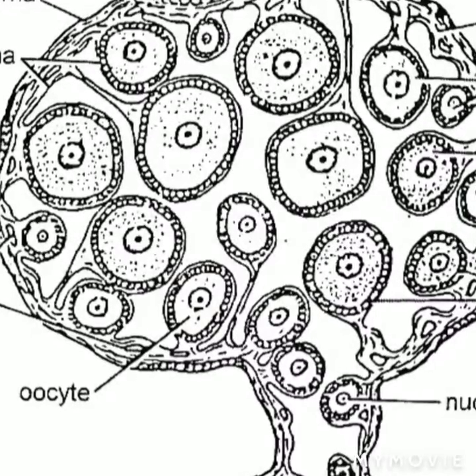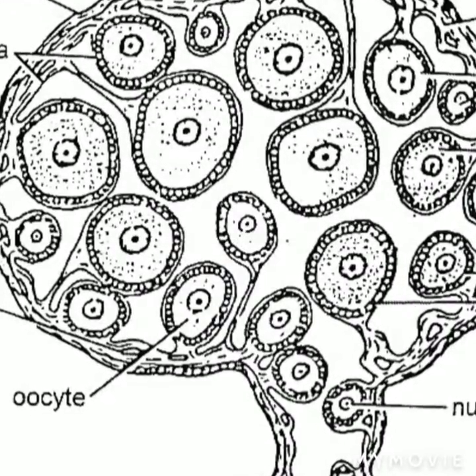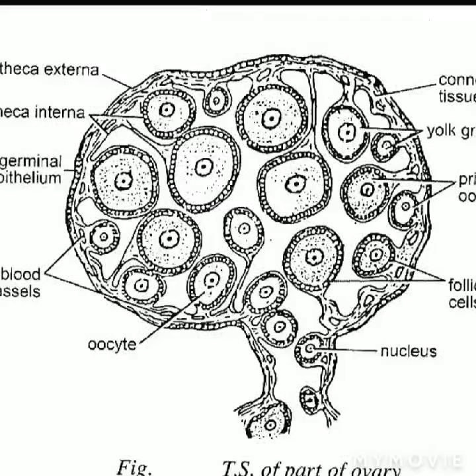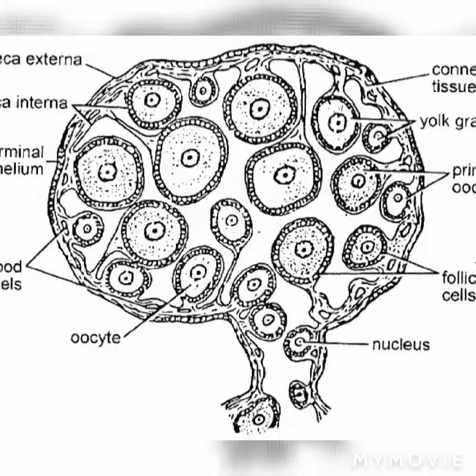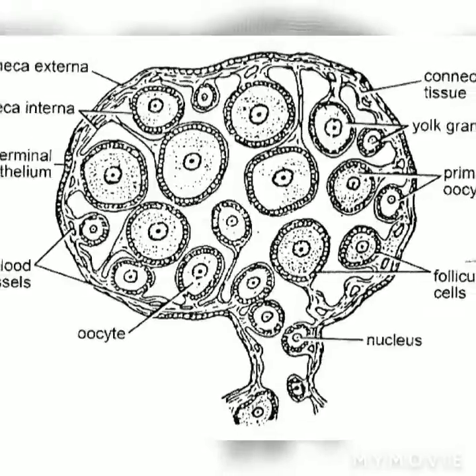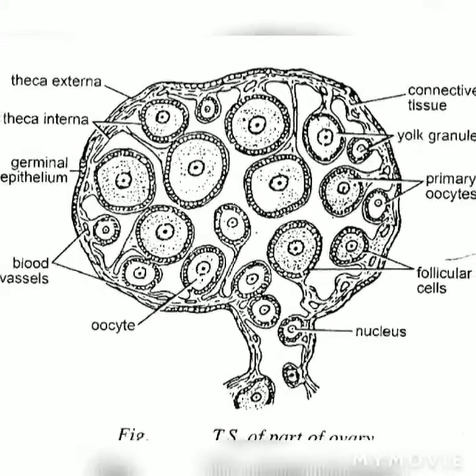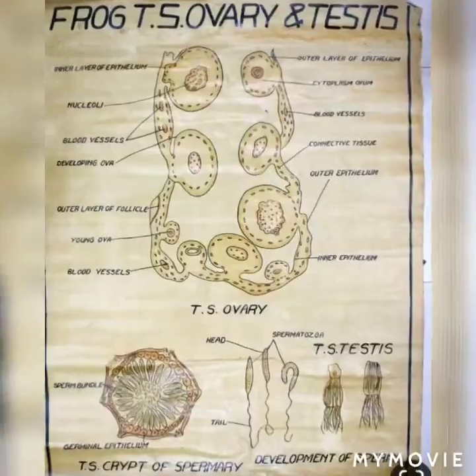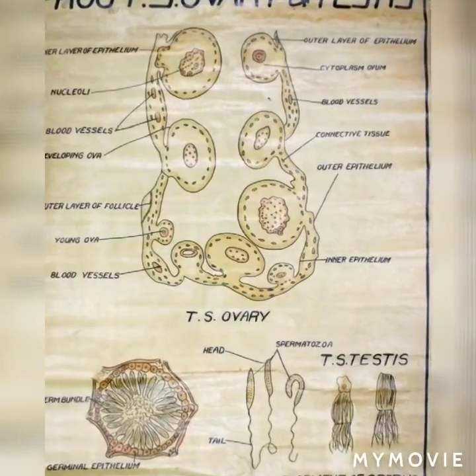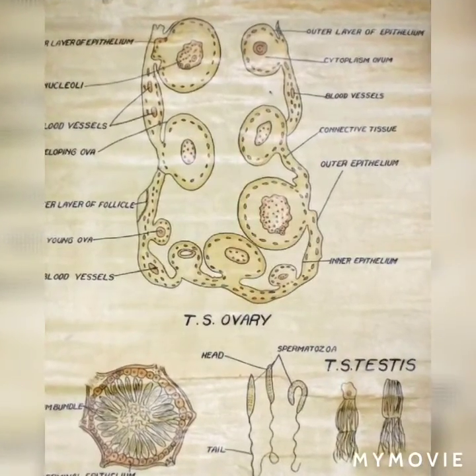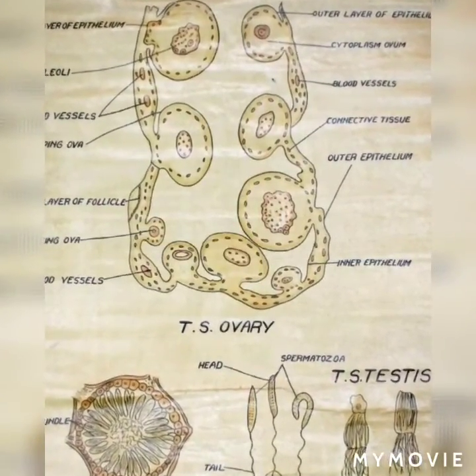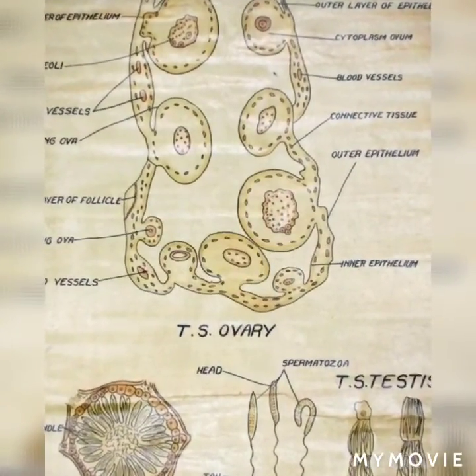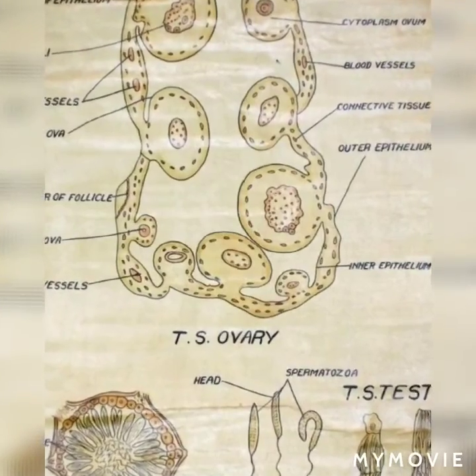Comments on TS of ovary of frog. The ovary consists of a number of hollow lobes or lobules in which ova are formed. Several follicles of various sizes are connected to the theca externa. Each ovum has a nucleus surrounded by yolky granular cytoplasm.